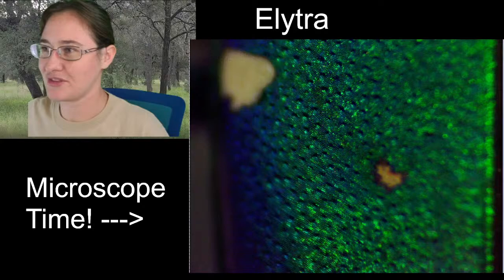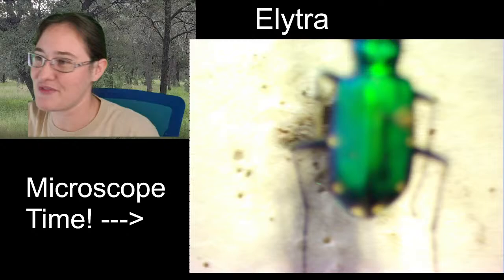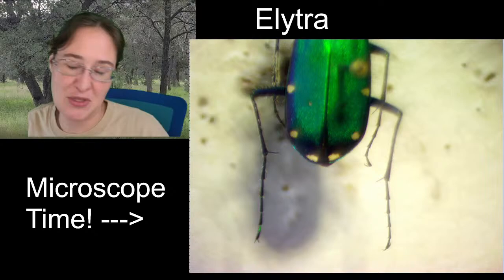All right, let's look at legs. And we might as well start with the back legs, because I know that the back legs have all of their toes, first of all, and they're very easy to see as pinned specimens, and we're already kind of focused here on the back end. Plus, the front legs have a couple of tarsi missing, and so this will be better.